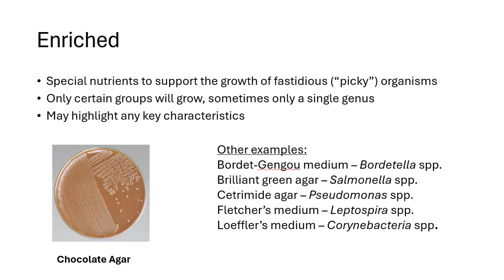Enriched media have special nutrients to support the growth of fastidious or picky organisms. Only certain groups will grow, and sometimes even only a single genus. Enriched media may highlight key characteristics. An example of an enriched media is chocolate agar.